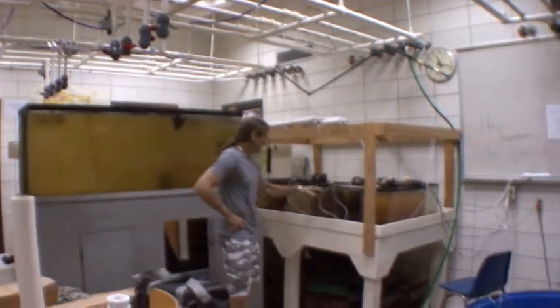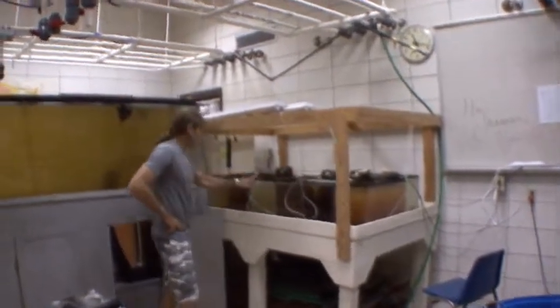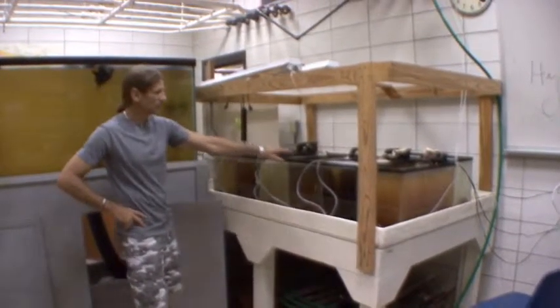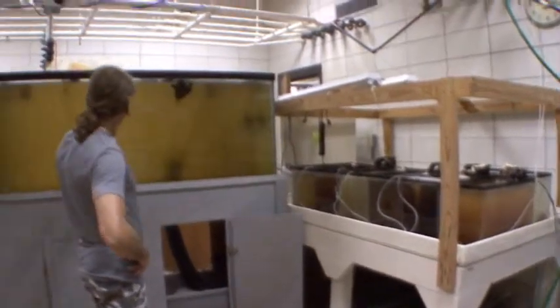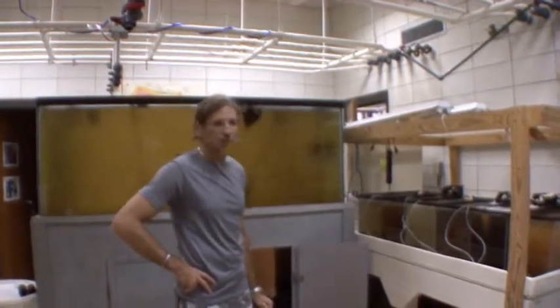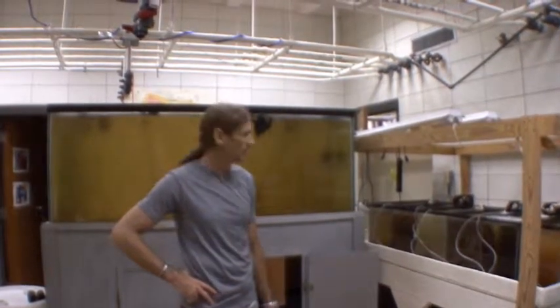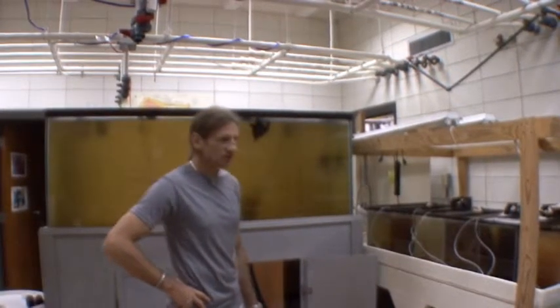As you see, this tank is almost black. This tank's not quite as dark. This tank, okay, yes, it's foul, but it's not near as bad as these others. That's because this is a soft gorgonian, and these are hard scleractinian corals. But they're all fouling, and I believe it's due to what they are exuding back into the tank and polluting the tank from what they're depurating out of their body, so to speak. And so that's what we're trying to do here.